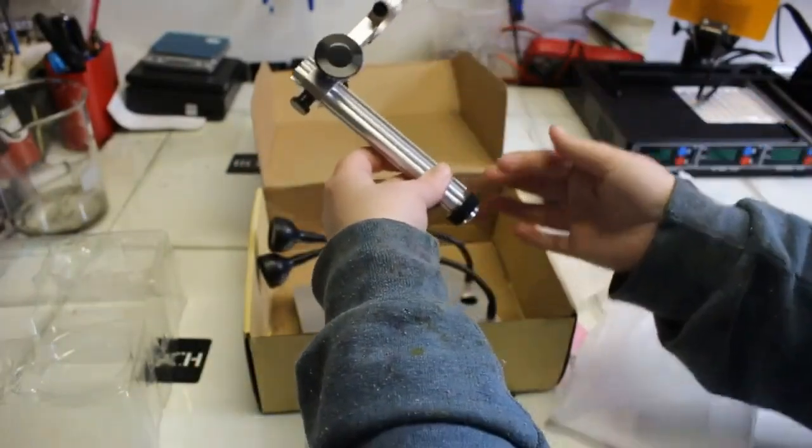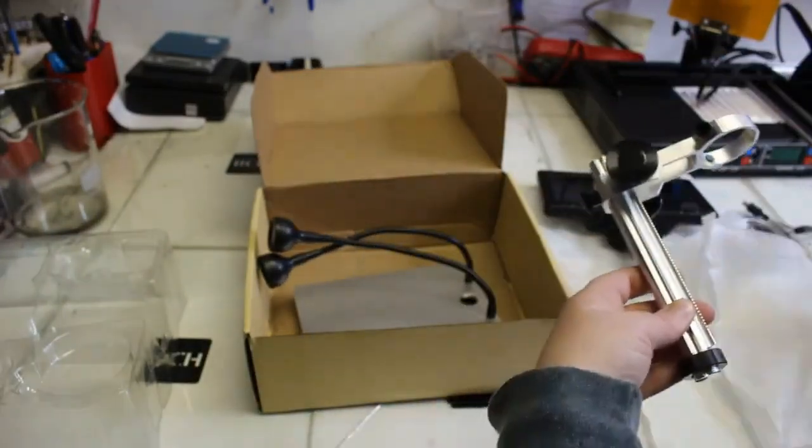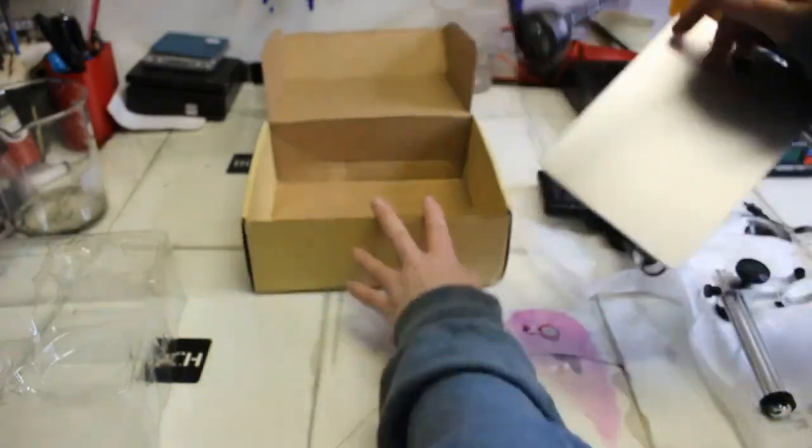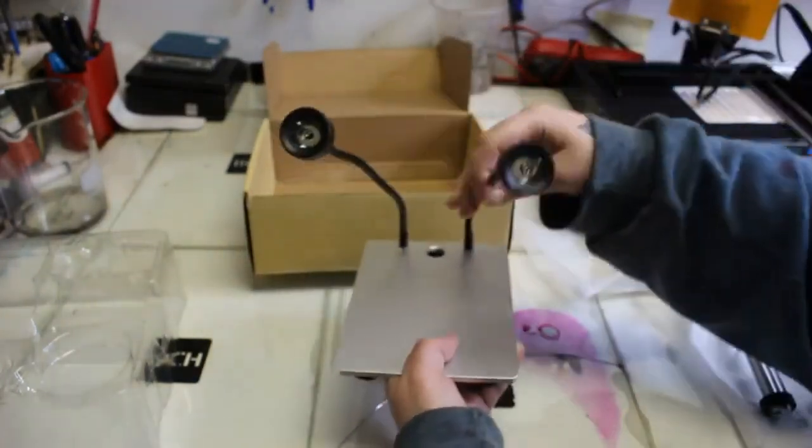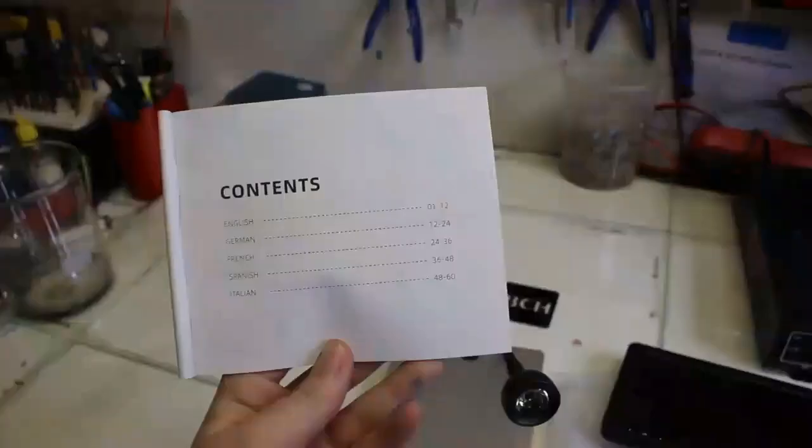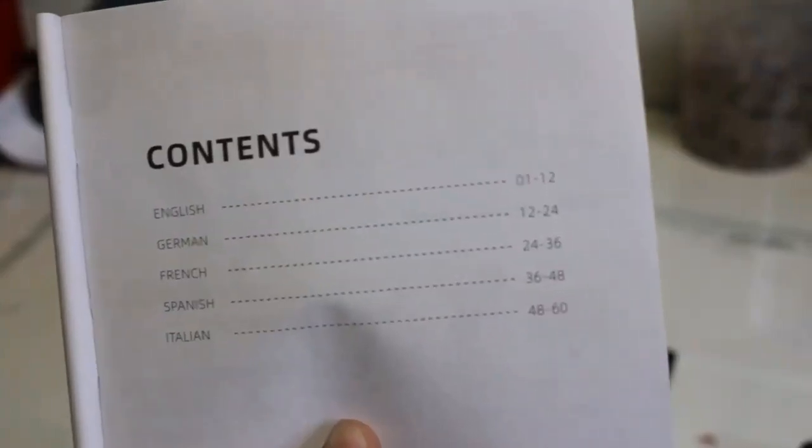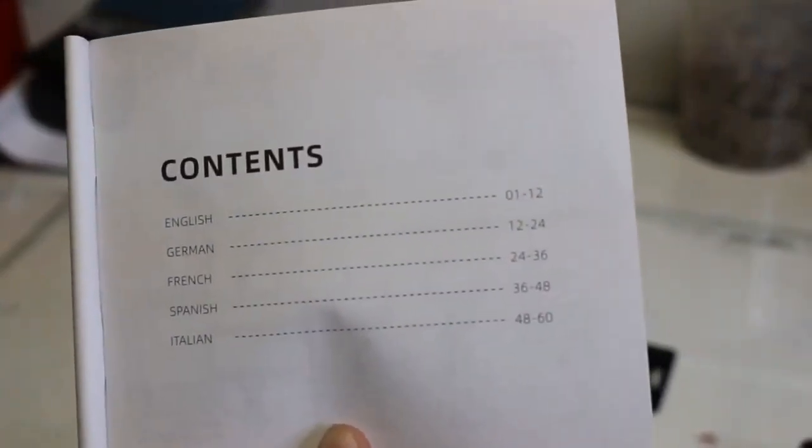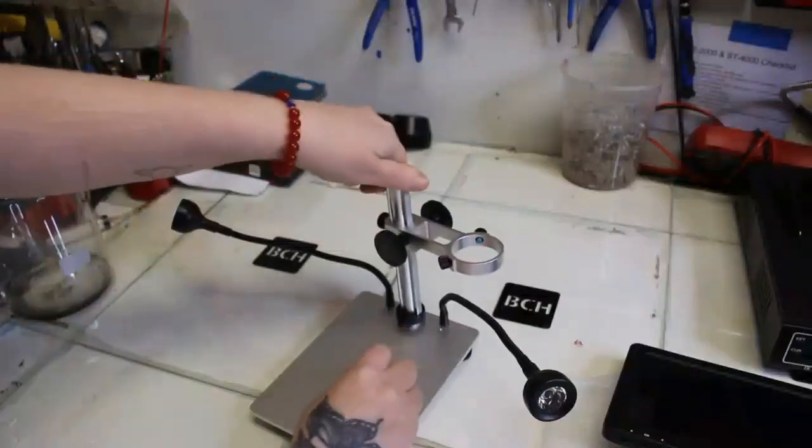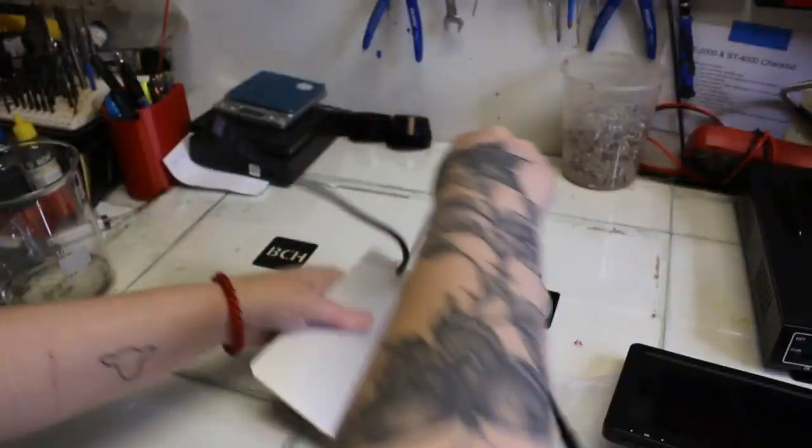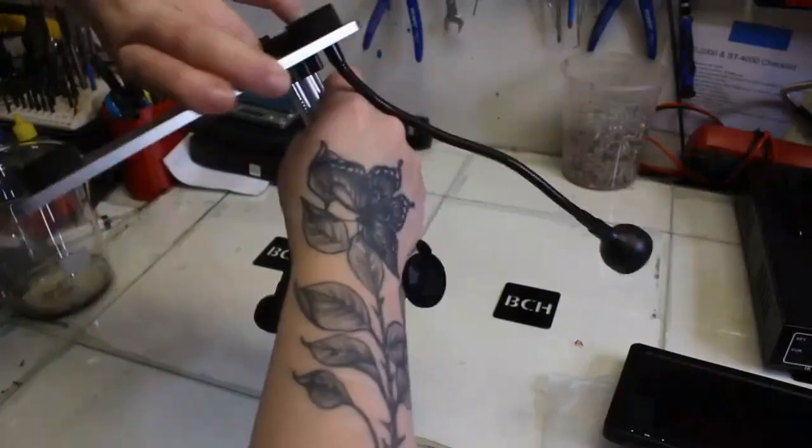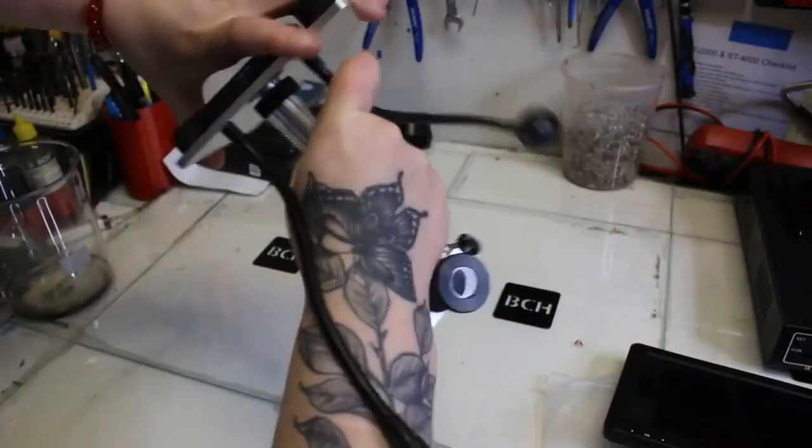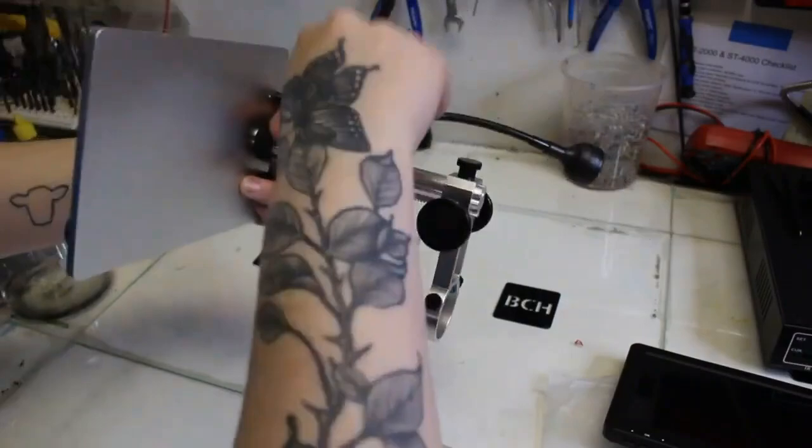Then we have the arm stand for the microscope and the last thing in the box was the base to the microscope with the two lights on it. Now here's the content package. This was really cool. It shows you what languages you need to look at depending on where you are in the book. One through twelve was for me because I speak English and explained the steps I needed to do.